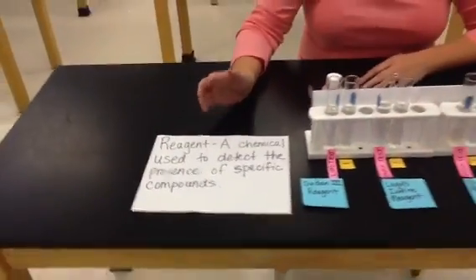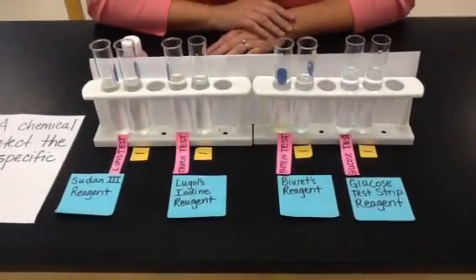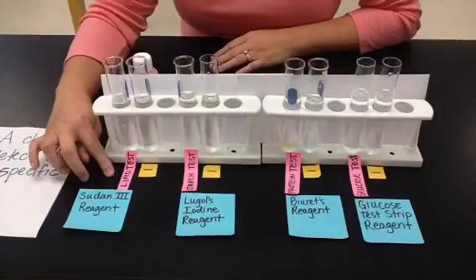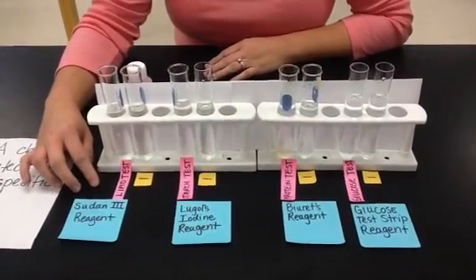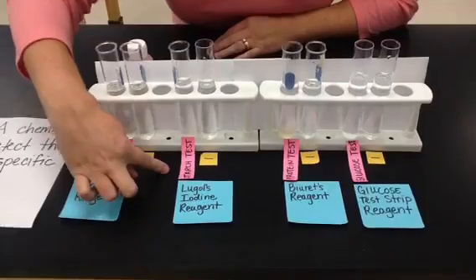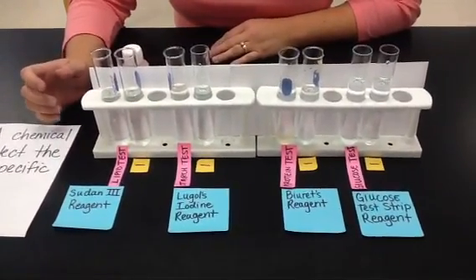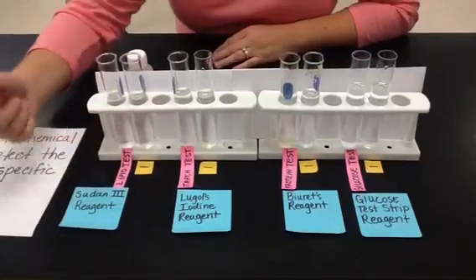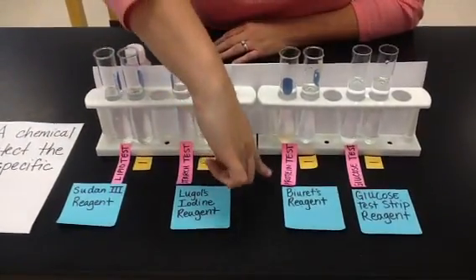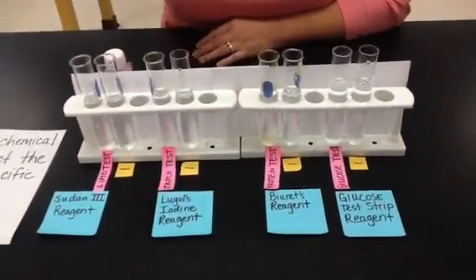So I have in front of me 4 solutions. And these solutions are my lipid solution. Remember, lipids are fats, oils, steroids, and waxes. I have a starch solution here. Remember, starch is a large polysaccharide. It's part of the carbohydrates organic compound family. And then over here, I have a protein test.